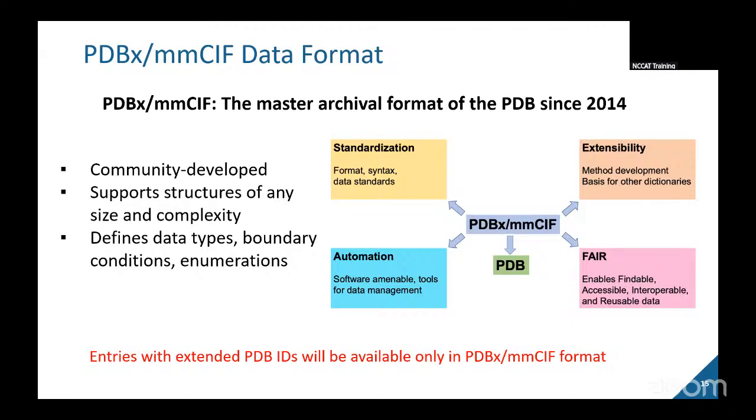The legacy PDB format relied on fixed template records for remarks. It's been frozen since 2012 because it's simply not extensible. While many people do like the simple layout, you have to keep in mind that it is difficult to extract metadata, and it's often error prone if you're using automated tools. In contrast, PDBX/mmCIF removes all of these barriers, so it will support data values of any width.